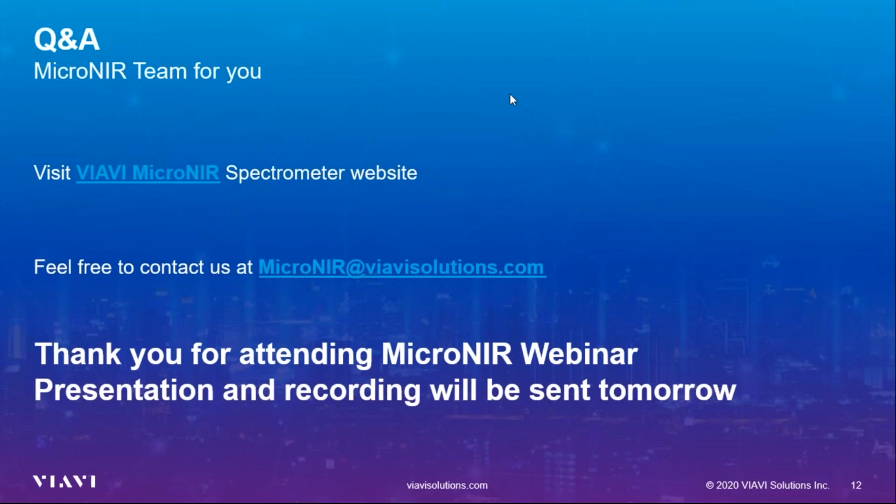For more complex mixtures, and also when I have different particle sizes, maybe I can use PCA, let me use this term, as a filter for filtering out the information that is not interesting and keeping the chemical information inside the data, the most important part of the variability, as we say in chemometrics. But PCA is the second step that you have to do if a simple moving block is not working. Something that I say every time, and Emiliano already knows very well, is the fewer the better. So if a simple approach like moving block works, let's continue with it.